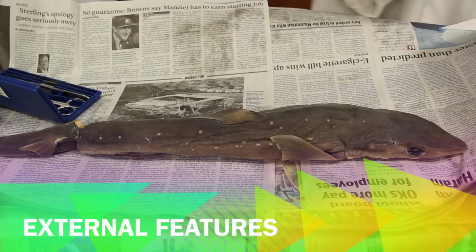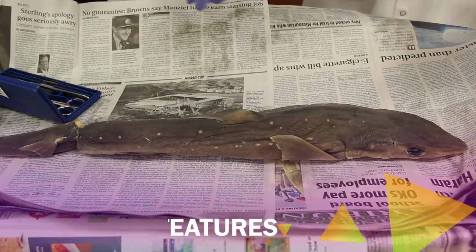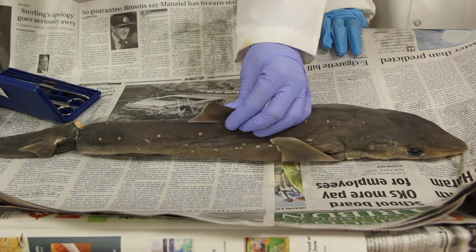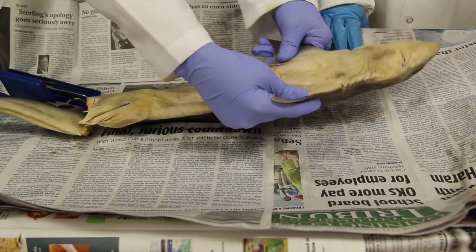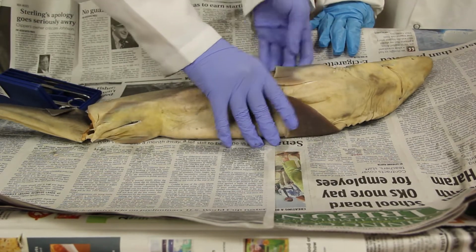And so first, before we start our dissection, I think we're going to go over its external features. The main ones that you guys need to know is the first dorsal fin. This is what you see in movies with the sharks. This is how they swim with it up, and it's usually above the water when they're surfacing. These are the pectoral fins. See how they're on their abdomen, and this is what helps them swim through the water. It's usually parallel to the water.